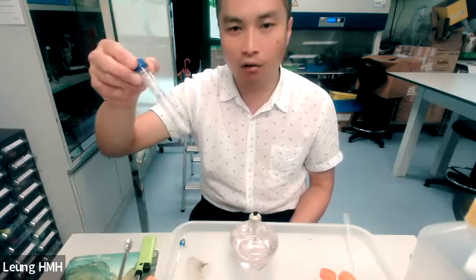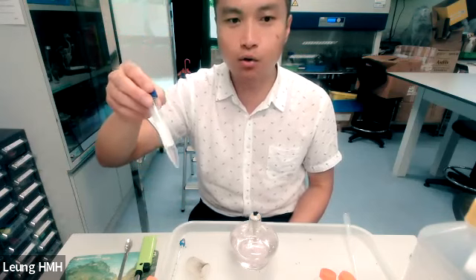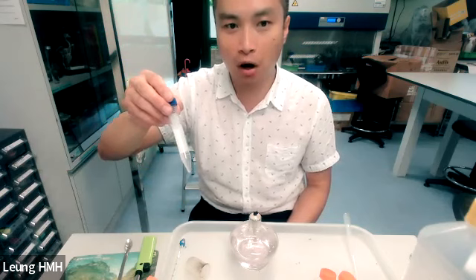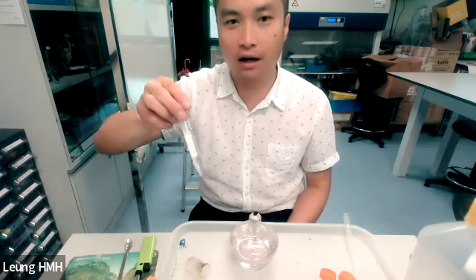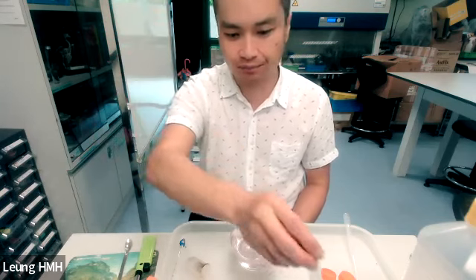And second is methanol. This is methanol. Methanol is a kind of organic solvent, used ordinarily in the laboratory and for commercial purposes. But now we are doing the experiment, transesterification. This is the major component for this.